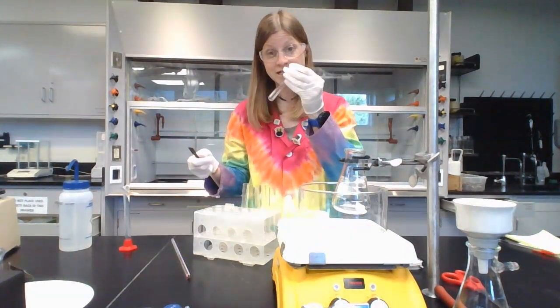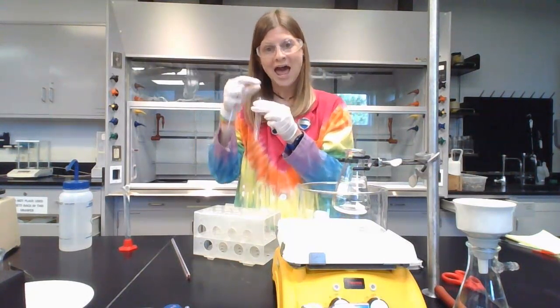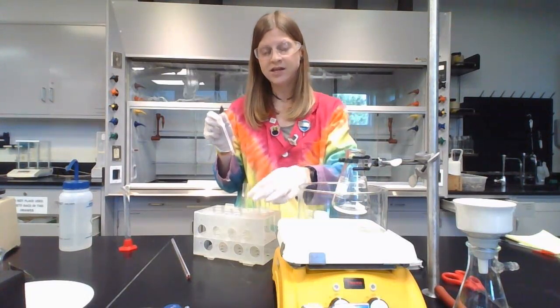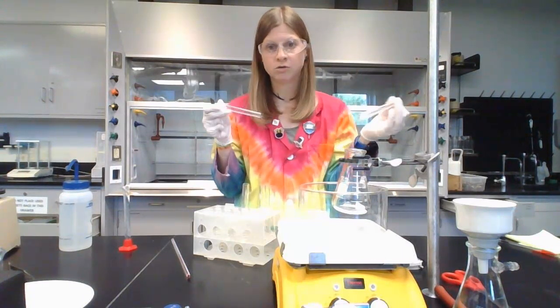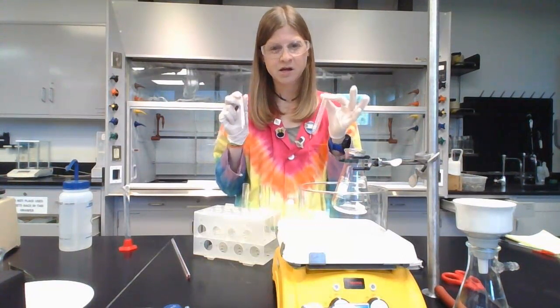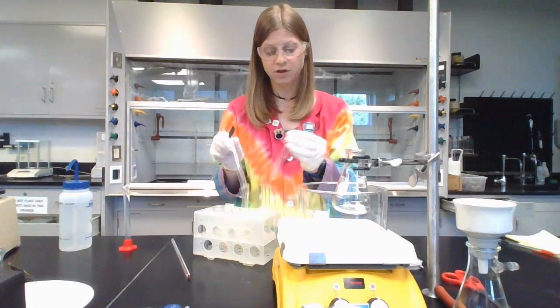So you're going to take a second test tube that's nice and clean, put in a few crystals, put in some water, stir it up real good, add 1 drop of the FeCl3, and write down what happens. Now these two things should have different things happen. So maybe they change colors, but they're different colors. Or maybe one doesn't change color and one does. But if they both have the exact same thing happen, then you had some contaminants between those and you should redo both of them. Okay.